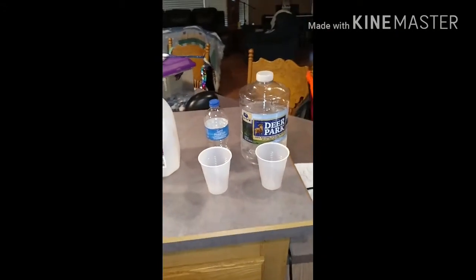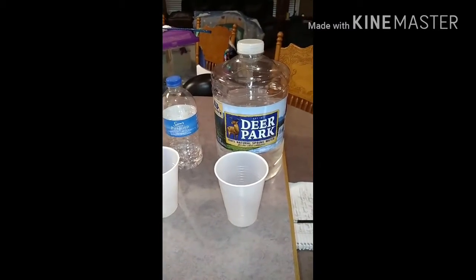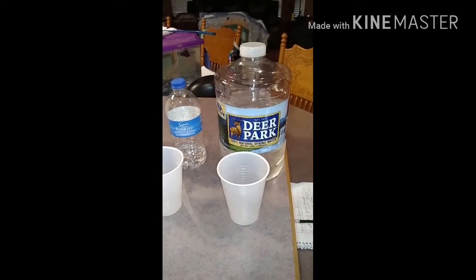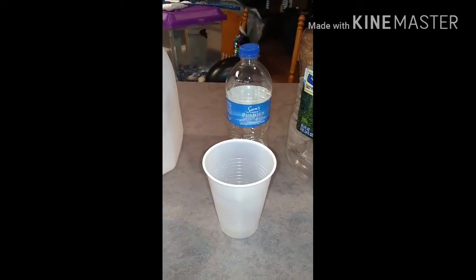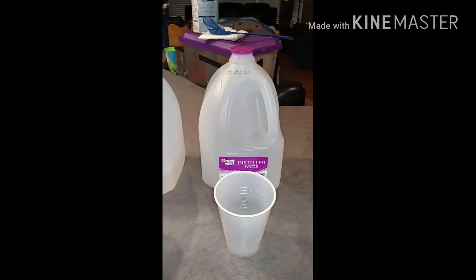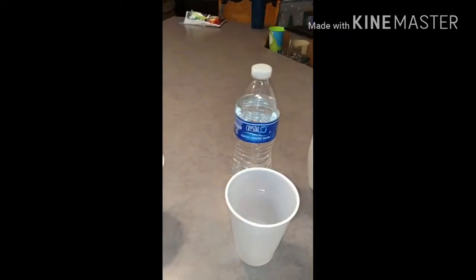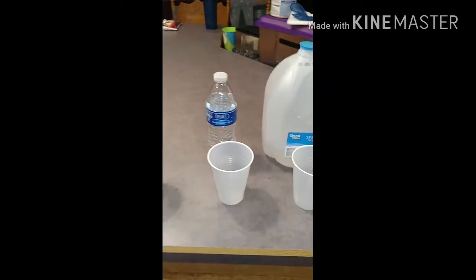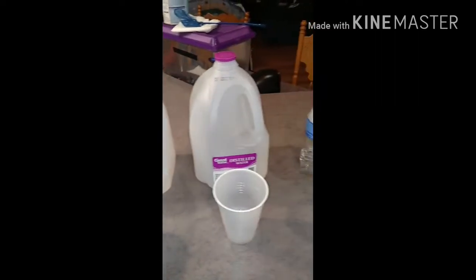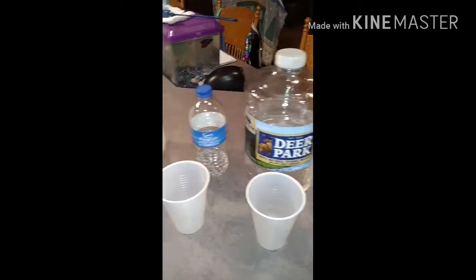We're doing a video today to test the acidic or alkaline levels of these waters — the pH balance of Deer Park, Sam's Choice purified drinking water, Great Value distilled water, Great Value spring water, and Crystal 2O from Save-A-Lot, and also our tap water here in Eastern Kentucky. We're in Magoffin County in the eastern part of the state, and these are a lot of the waters that are available to us here, so I figured I'd do this video.